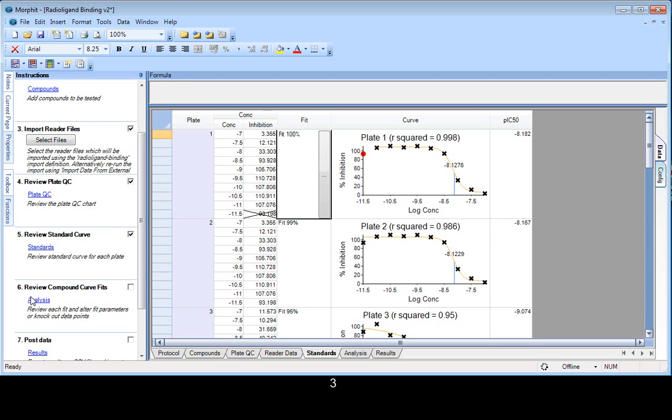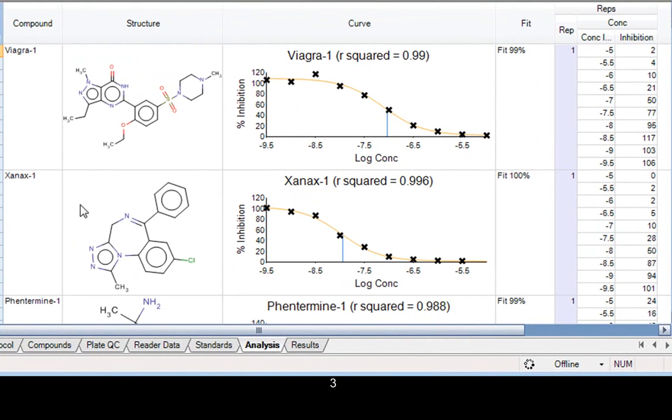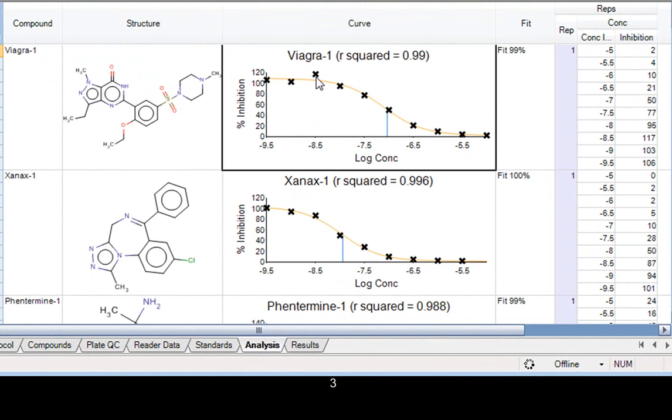So the next stage is to look at the analysis for the compounds. We can see each of the compound labels have been brought through, as has the structural information and the curve as well. And again, we can interact with the curve fits. Knocked out data points. And we see the knocked out data points is also shown on the concentration innovation.